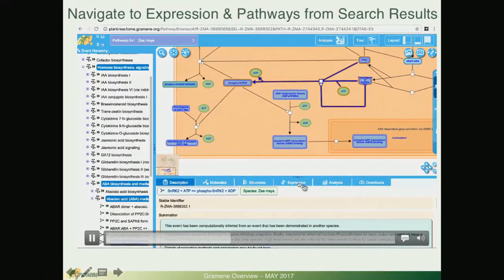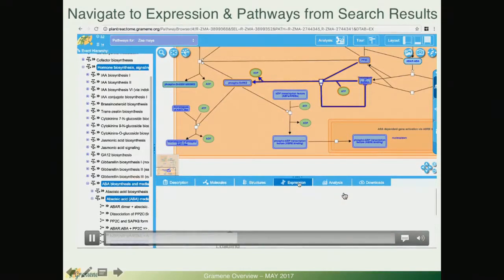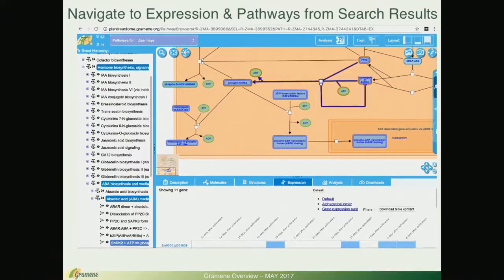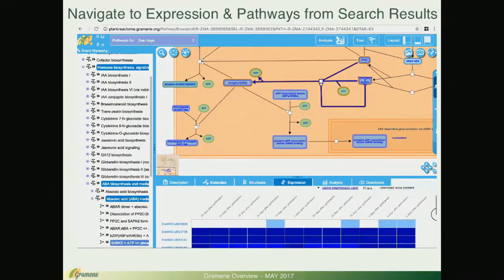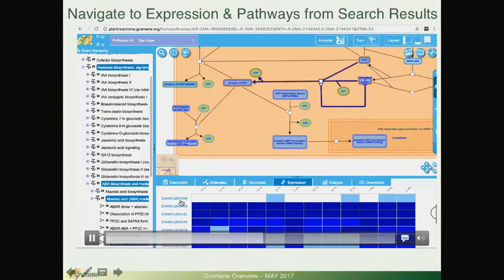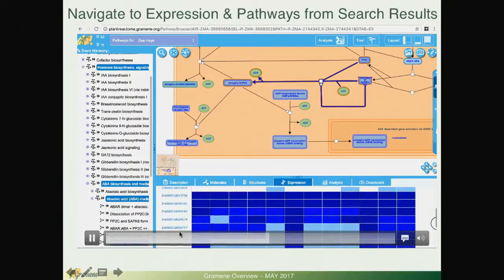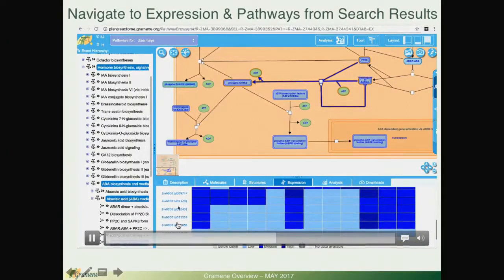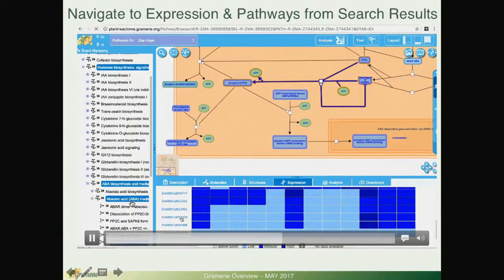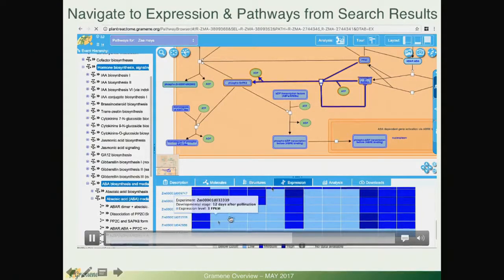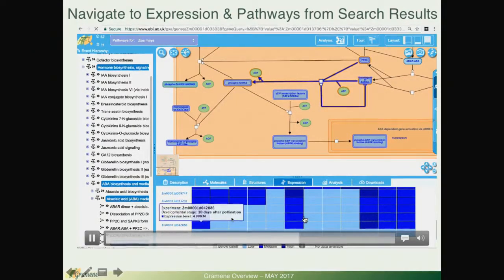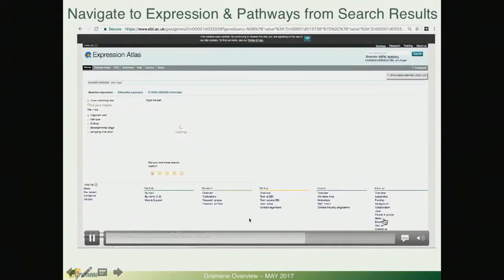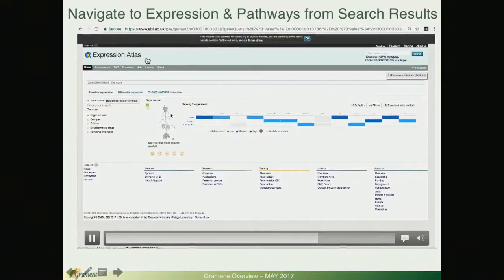If we click under this tab we have also used the Atlas widget and you will see that now it is not only one gene but all of the genes that are involved in this pathway of abscisic acid that we have together with expression information in different tissues. If we click on them we are being taken to the expression atlas website.